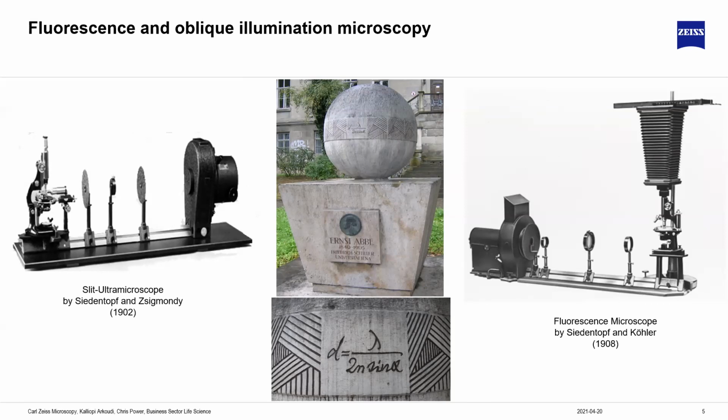The first is the wavelength of light you use, and the second one, the component at the bottom here, is effectively NA, the angle over which you can detect. So NA you can build upon and improve by building better optics, but at some point you hit a limit where you have as large an angle as you can have going into the sample, you're collecting as much light as possible, and you hit the resolution limit.